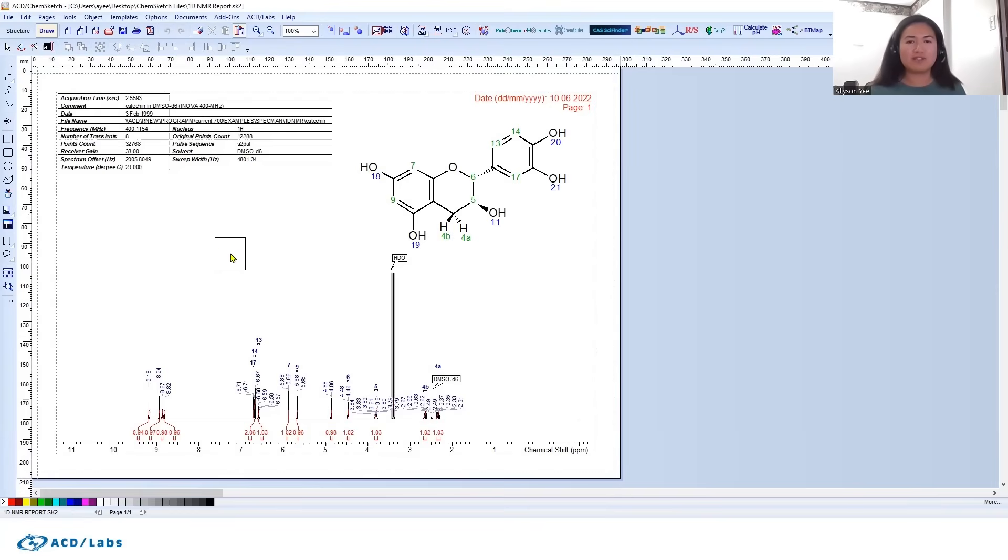you can see that I have this box floating with my mouse and my cursor. So what I can do is if I click it there, it pastes that zoom-in, and now I can actually resize this like so. You can really get more details of what's going on in your report.